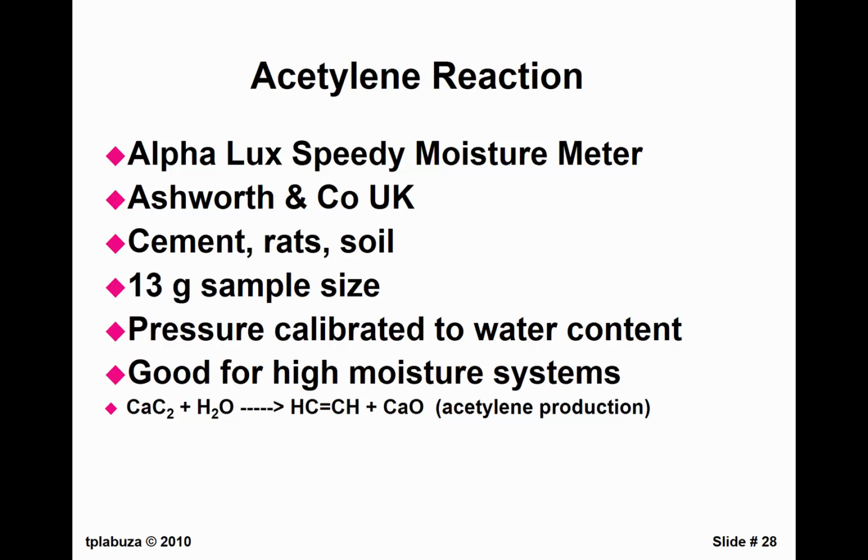Did you mention that with Karl Fischer, high moisture foods could potentially be a problem to measure? Well, it's just the ratio of methanol you use. With a high moisture food, you use more methanol. So can you use milk? Yeah, you can. You've got to know the range for that coulometric cell. I put one set of numbers there, but different companies sell different cells, and they have different ranges that it works in. So if you use more methanol and you grind up a piece of meat and put it in, you know approximately what the moisture is going to be.